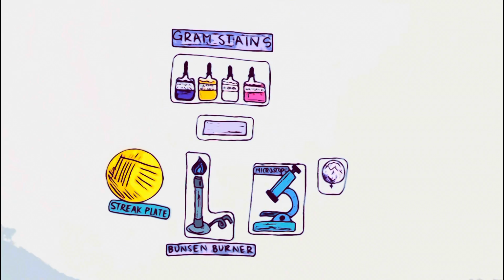After the staining process, look at the cells underneath a microscope. If the cells are purple, they are gram-positive, and if they are pink, they are gram-negative.